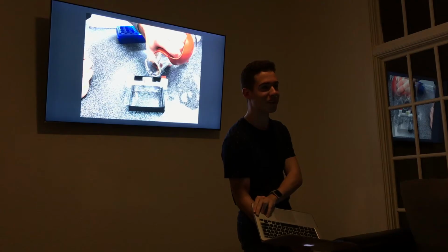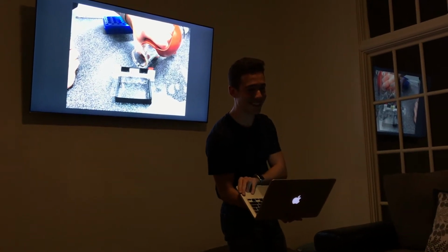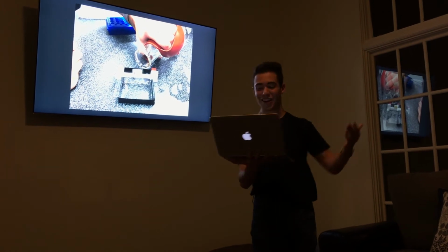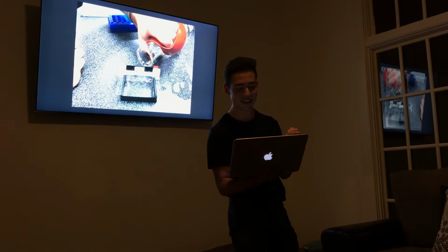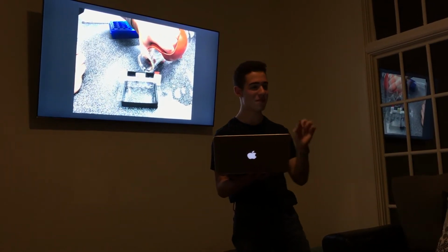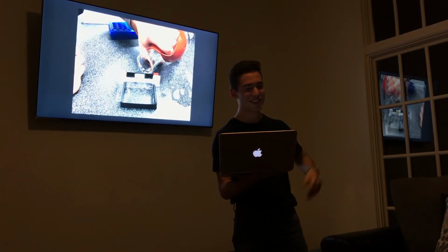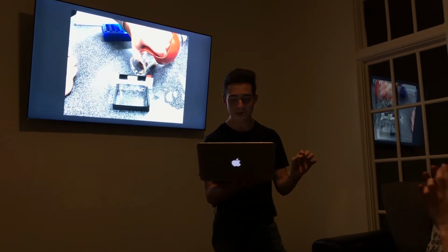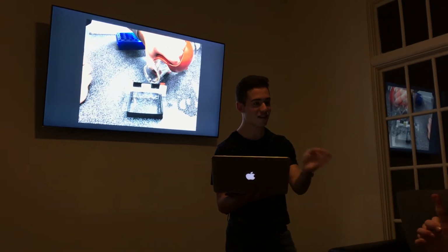So, you're probably thinking that this is impossible. We did not do this, right? But no, we did! Look, we have an experiment. We too were astounded by this technology, but we tested it by conducting a simple experiment where we tried to sort out the dyes of candies and mixed substances. We sure are clever. Now, sure enough, when putting these dye samples into a simple gel apparatus and stimulating it with electricity, we were able to get the mixed different colored dyes sorted out.